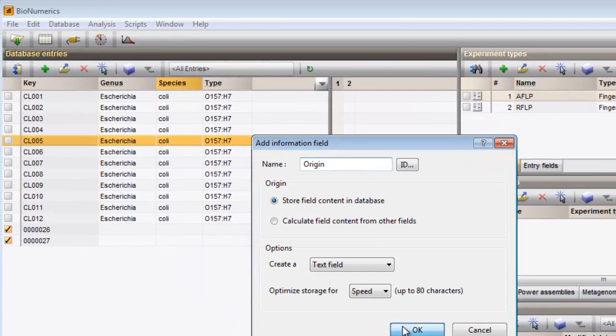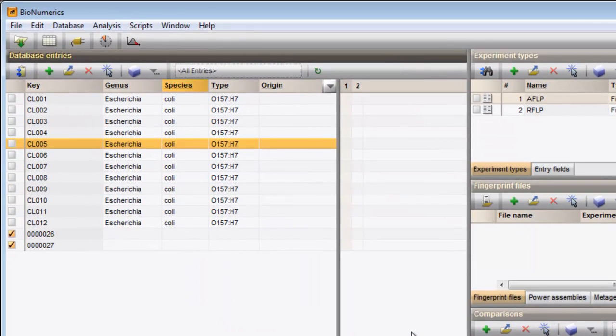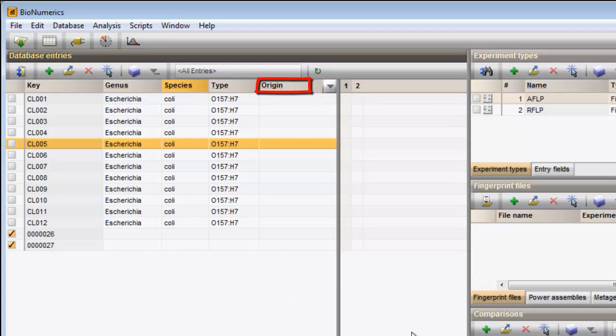Pressing OK saves the new field to the database. The field appears next to the existing fields.